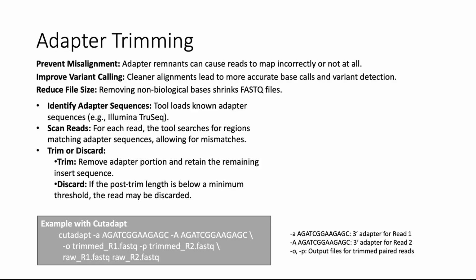So getting back to our pipeline for bioinformatics data, we'll start with adapter trimming. There are artificial additions to our biological samples, so we don't need them for alignment, and if we keep them, they can result in incorrectly mapped reads, and also it will result in bigger files, so we are able to delete them, trim them, and discard.